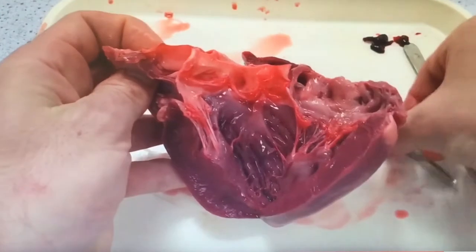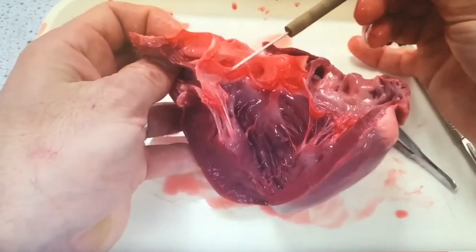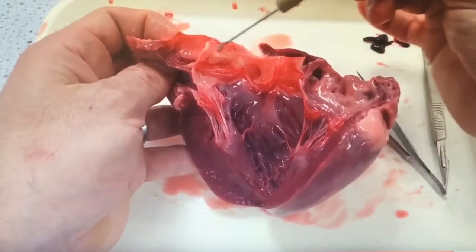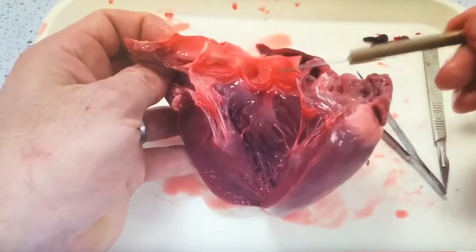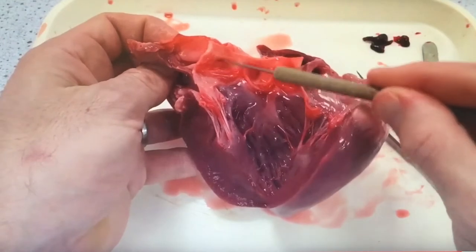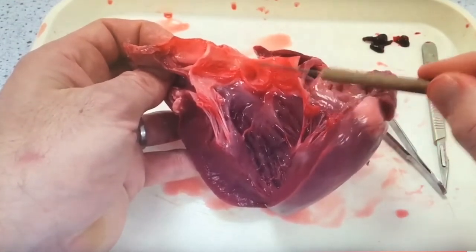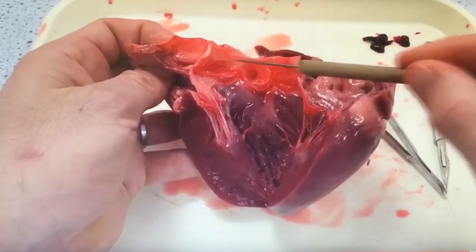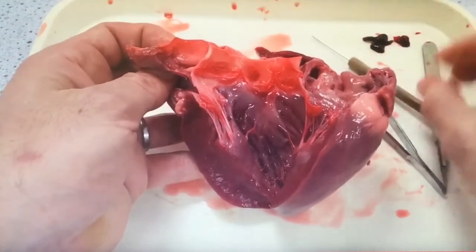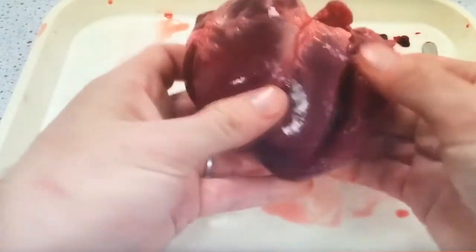This is a really cool bit. Sven takes the needle and identifies the three cusps that make up the semilunar valve, then points out the holes behind them — slightly in the entrance of the aorta. These are tiny holes and they serve the coronary arteries — the arteries that serve the heart muscle themselves. They don't go outside the heart; they bury themselves deep into the wall of the cardiac muscle.